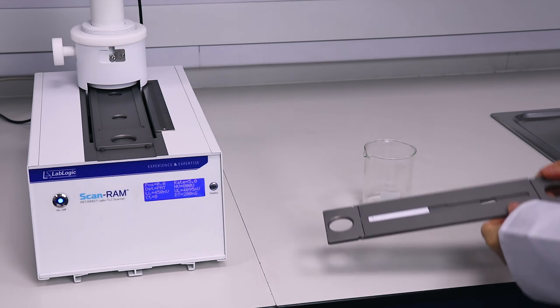The TLC plate beds are used for transportation of the TLC strips whilst reducing the risk of contamination and the finger dose to the operator.